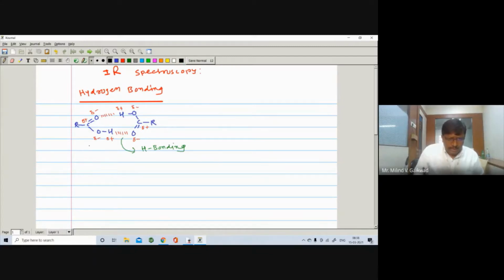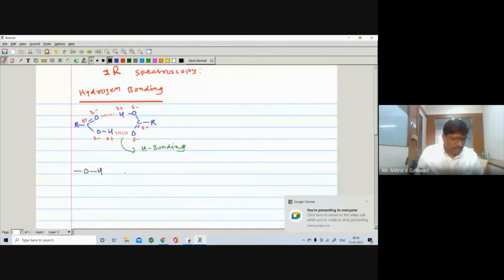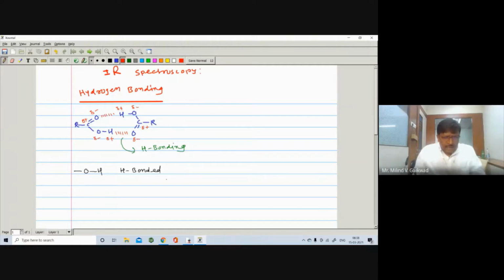If there is an OH with hydrogen bonding, H bonded, then due to the H bonded stretching frequency there is a band at 2700 to 2500 centimeter inverse. So remember this point.